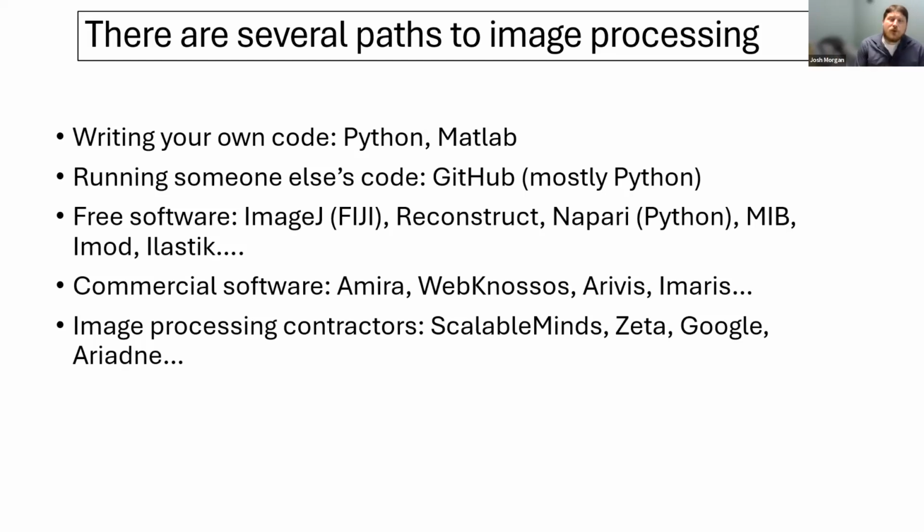Okay, so now I'm going to try to go through some of the steps for image processing. The first step is to take images that are amenable to image processing. And so we'd all like low noise, high resolution images that AI would love to see and figure out and give us good alignments and segmentations of.